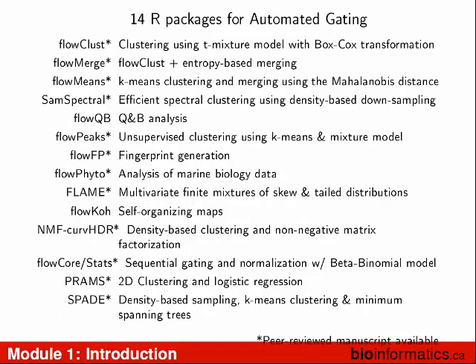Where the real bang for the buck has been, though, is in gating, because we recognize that as a pain point for you, and it's also kind of cool to solve that kind of problem because it's the kind of thing that statisticians get a kick out of. So for these two reasons, there's been a lot of development in R to solve automated gating. Lots of different packages.